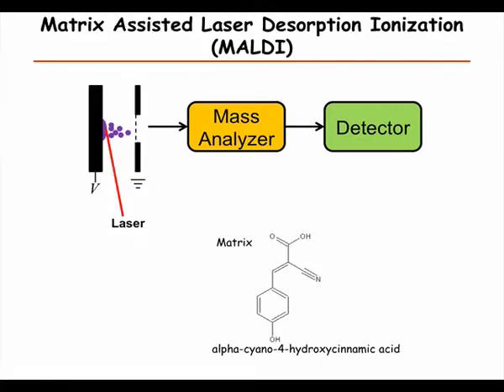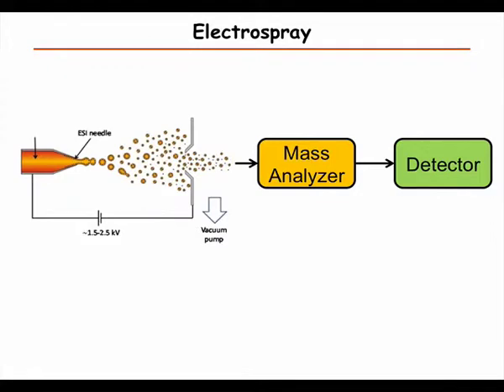So how much, sorry for interrupting. No, no. How much sample are you losing at this step? Approximately 10%, 20%? I mean, I think more like 90% is typical. 90? Yeah. I mean, people are trying to make it efficient, and maybe it's 50% sometimes, but it's a lot.